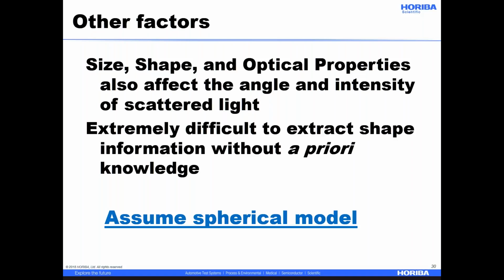And so you can't really get that analogy to a single crystal diffraction pattern you can get with, say, X-ray diffraction of proteins or crystal structures. So we do assume a spherical model. It's very important to keep in mind as you start comparing with other techniques.